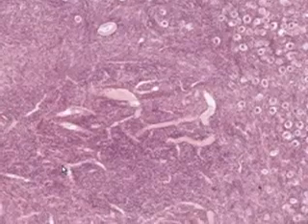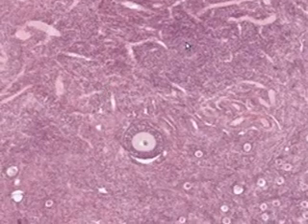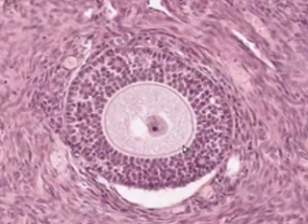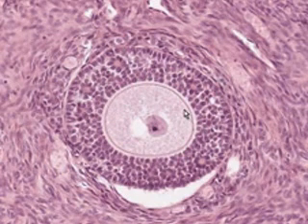In addition, when you see a follicle in which you have a clear-cut little crisp membrane around the ovum, which is called the zona pellucida, you now know you are in a secondary follicle, and all of these cells surrounding the ovum, external to this crisp little refractile zona pellucida, are granulosa cells.